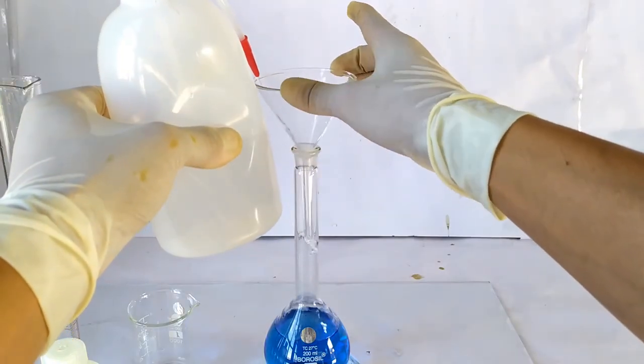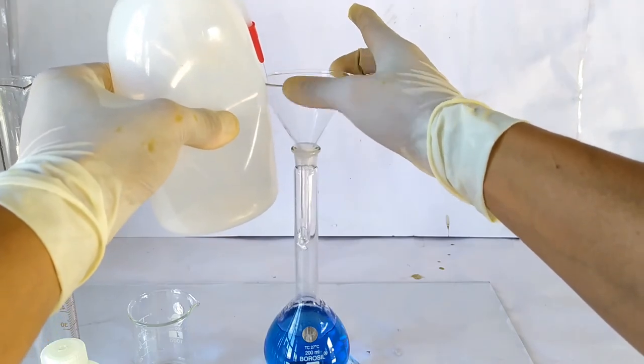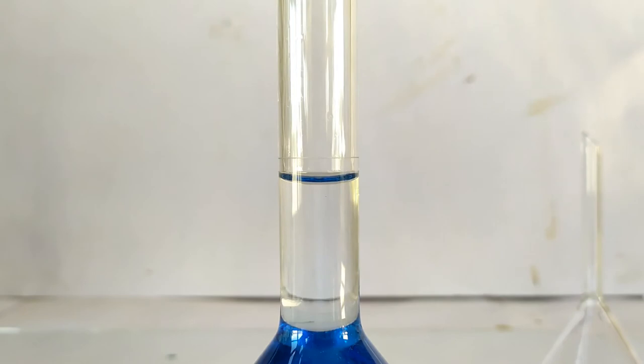Finally rinse the funnel a few times with minimal quantities of distilled water. Make up the final volume in the flask or the cylinder to 200 ml using distilled water.